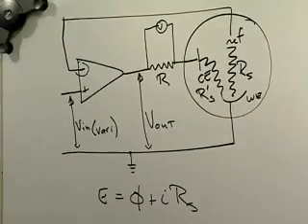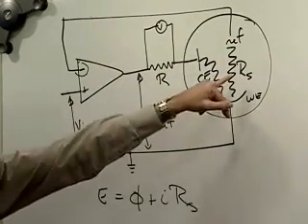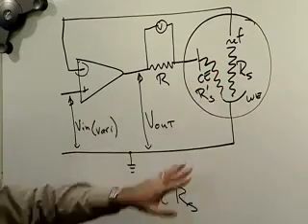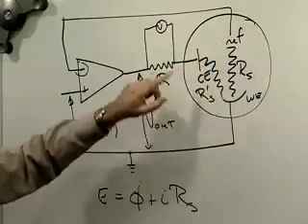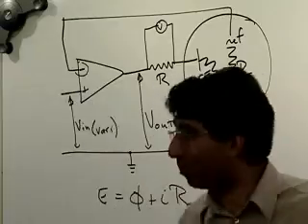We have a total cell resistance, which can be thought of as the sum of these two resistances, RS plus RS prime. We're knocking out RS prime essentially by using a high impedance, low current pathway there. And we put up with whatever's left over. But remember, it's always there.